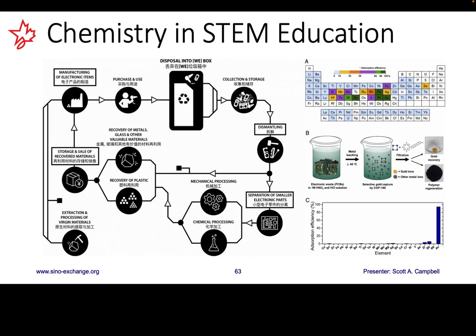Please note that it's very important that each metal is extracted in the correct order to ensure purity of the recovered metals. These metals will include copper, lead, iron, and the more precious metals such as silver, gold, and palladium. Once each of these metals has been precipitated out of solution, it will then need to go through a number of refining processes before smelting. While this process is too complex to explore in school, a simplified process where only the exposed gold is recovered can provide students with an authentic learning opportunity.